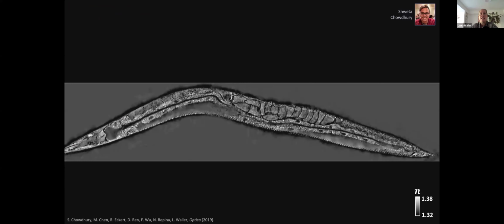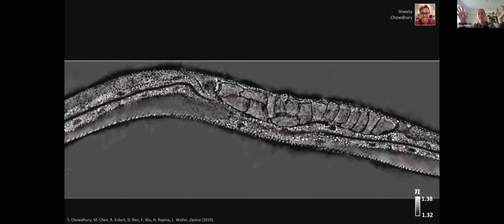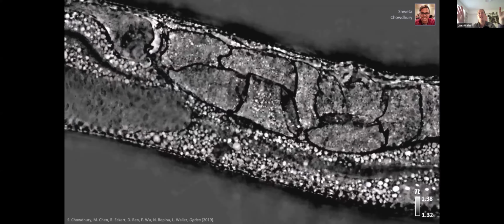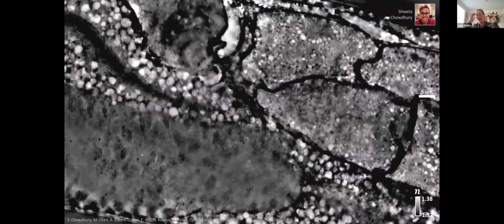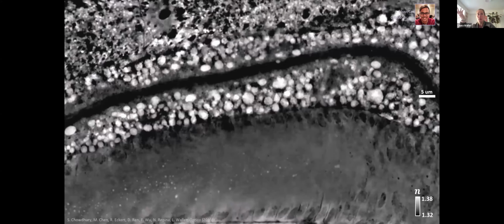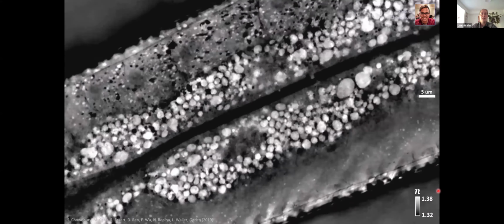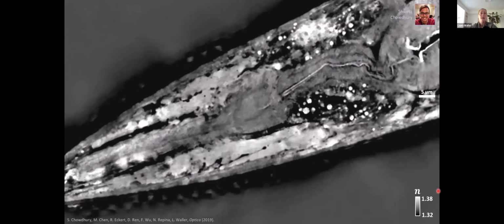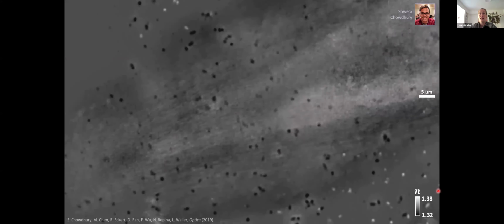And that is just a tiny little subsection of this gigantic 15 gigavoxel quantitative refractive index map reconstruction. I'm just showing you the central slice of this worm, and this is a refractive index map inside the worm. If you just tried to image this with a regular microscope, everything would be blurry because of the sample-induced scattering, because it has all these little balls of refractive index contrast. This is one end of the worm, and I'm just going to show a couple of different depths so that you can get a sense for the 3D information that's there.